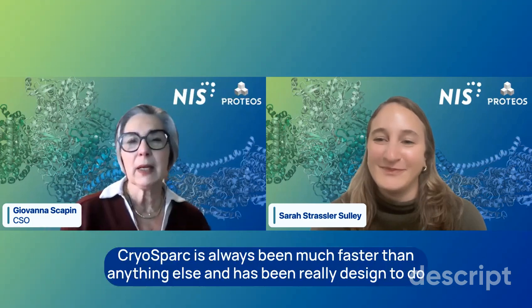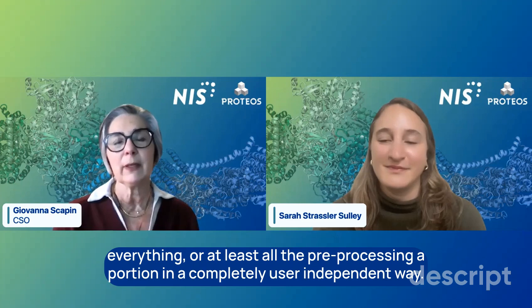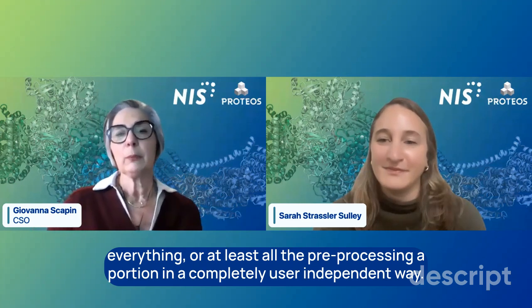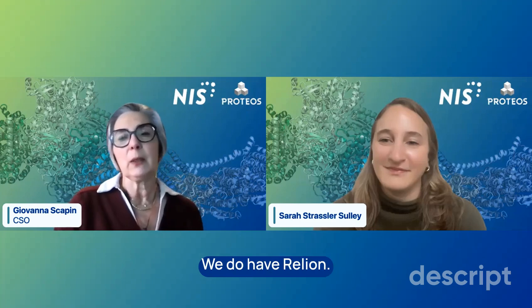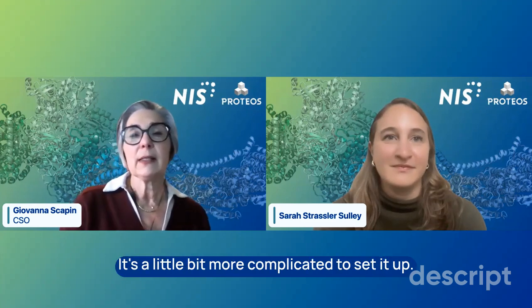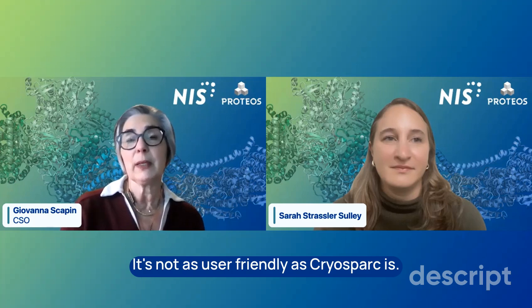I don't know. CryoSparc has always been much faster than anything else and has been really designed to do everything, or at least all the pre-processing portion, in a completely user-independent way. We are a CryoSparc shop. We only use CryoSparc. We do have Relion. We don't use it for pre-processing. It's a little bit more complicated to set it up.